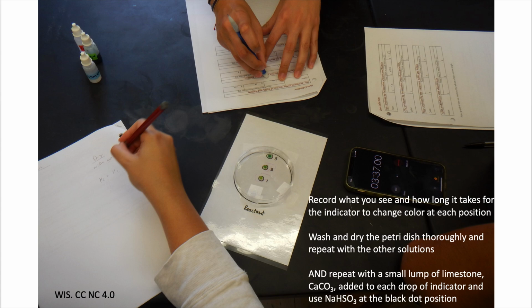Record what you see, how long it takes for each of the indicators at the different positions to change colour. Please record both quantitative and qualitative data. What do you see before, during, and after?